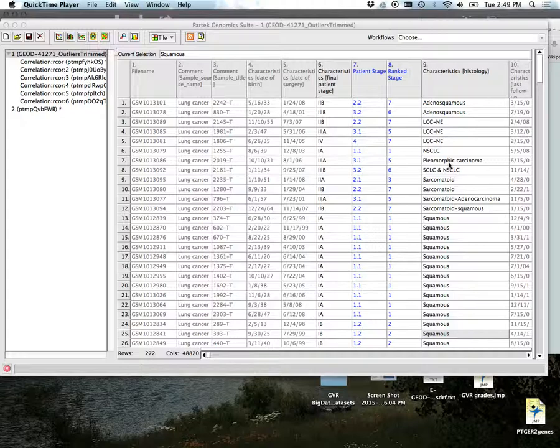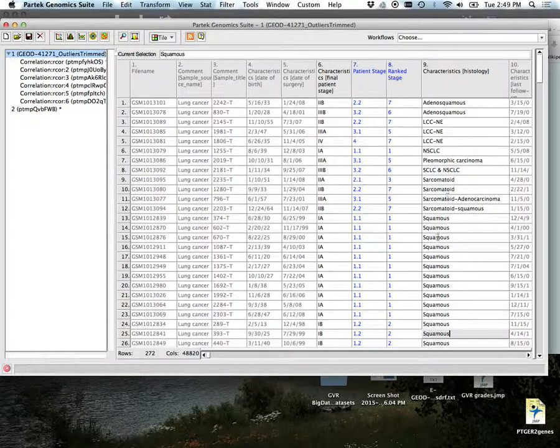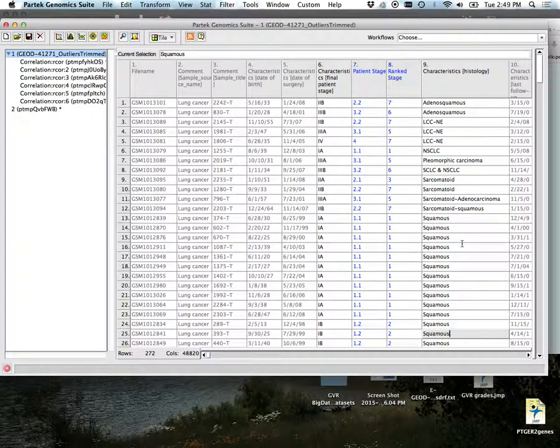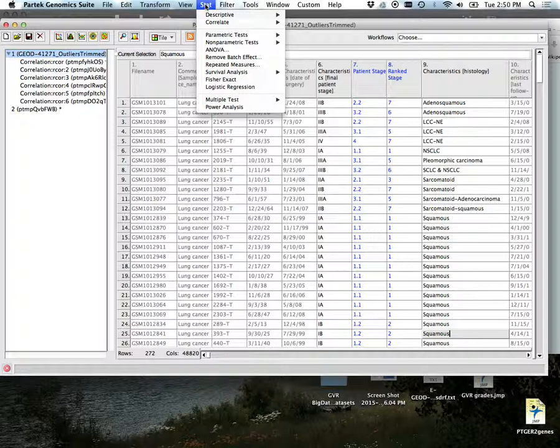Here's what you can do: you can do all kinds of different tests. Just find some of your data sets. In my instance, I have squamous cell versus normal, or squamous cell and adenocarcinoma. I can test to see what genes are different between that type of cancer. And here's how we do that. We need to go to stats. We go to this ANOVA function, analysis of variance.